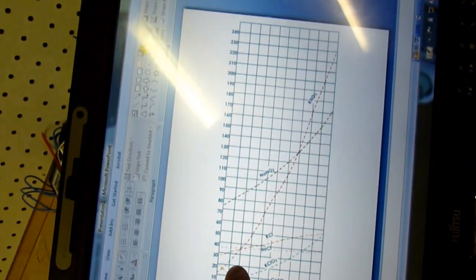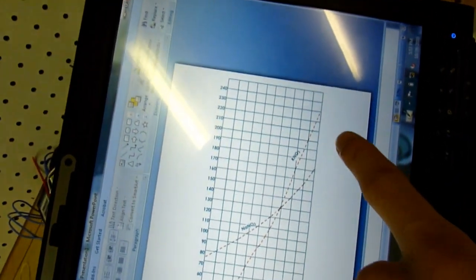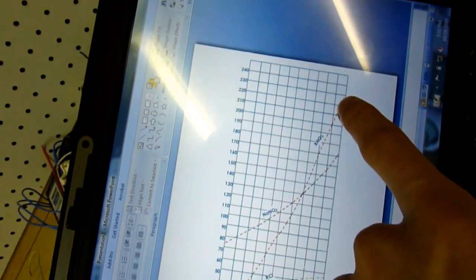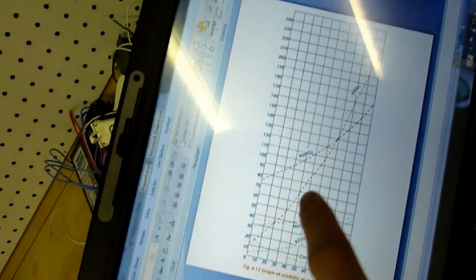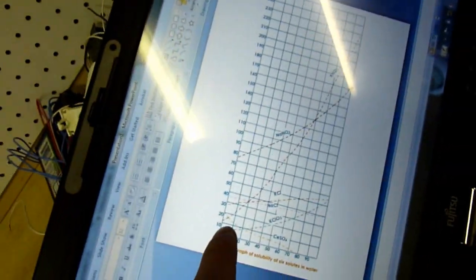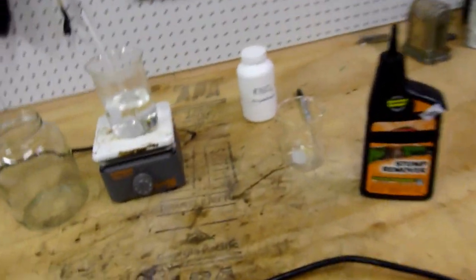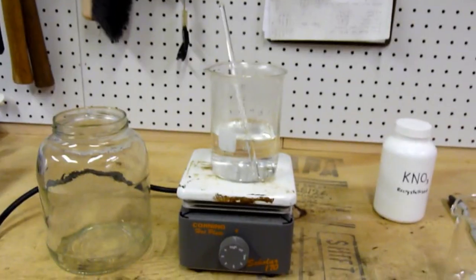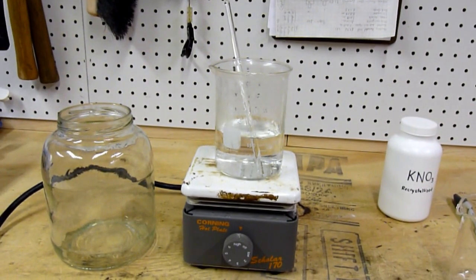Basically what we're going to do is heat the water all the way up so we can dissolve this much potassium nitrate in it. Then once that's dissolved, we're going to cool the water down so all this potassium nitrate falls out of solution once we reach this temperature, which can be done easily with boiling water in a freezer. So this video will take several parts to film.